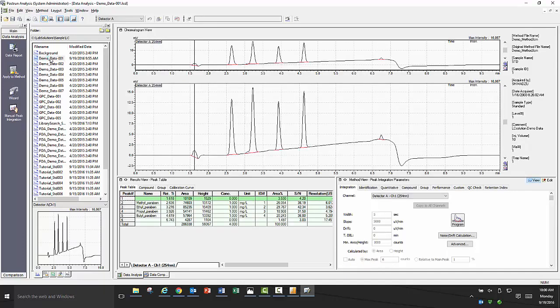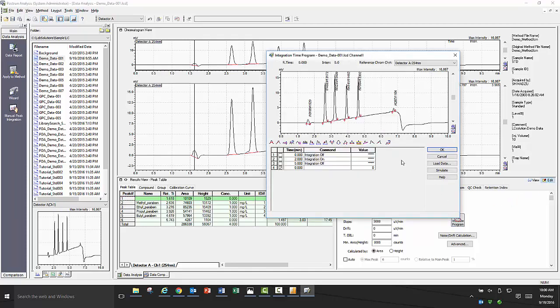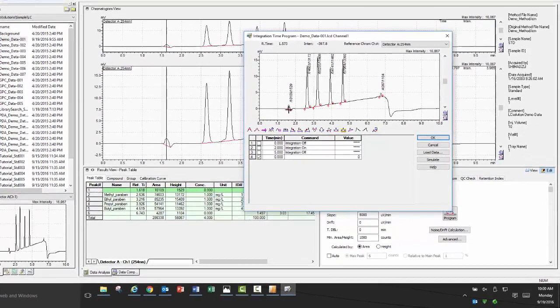One of the first processing parameters you will want to check in any data file is integration parameters for your peaks. The best way to look at your integration parameters is to click on the edit option in the method view, then click on the program icon. You will then get a pop-up that will let you preview how your integration parameter changes will affect the chromatogram.